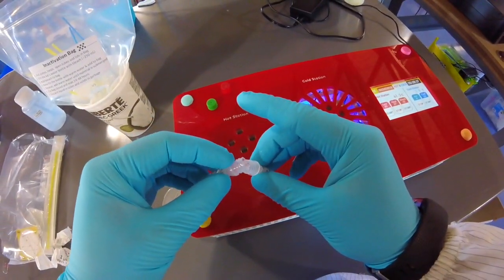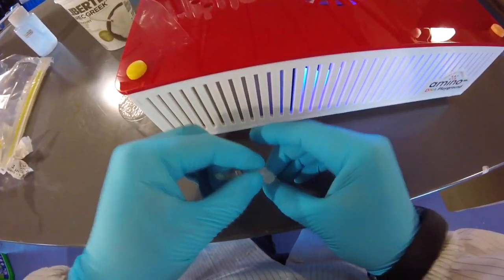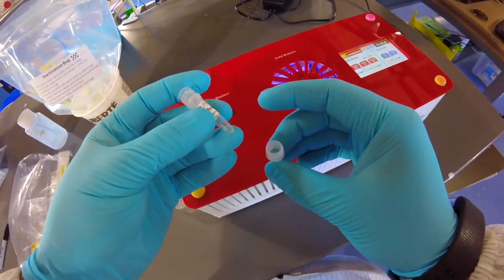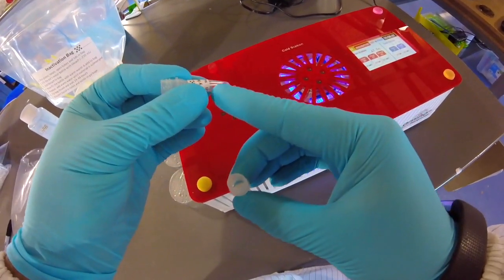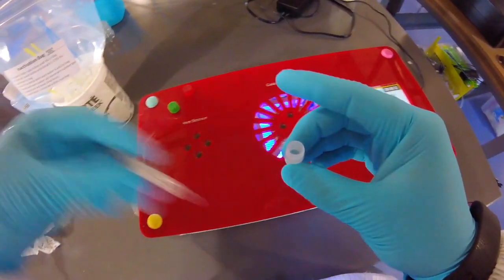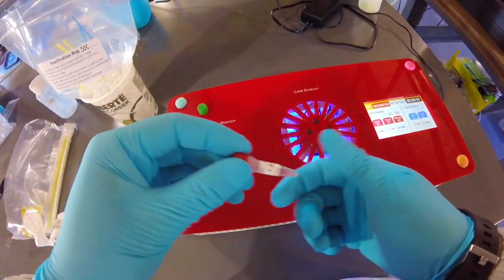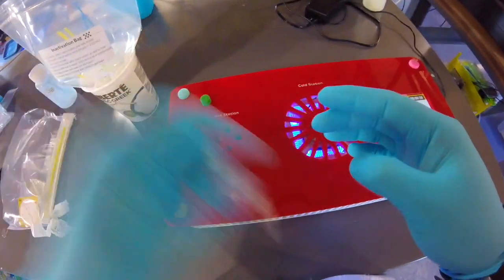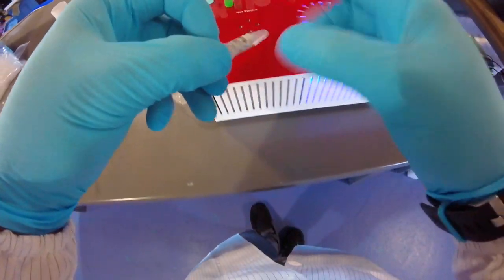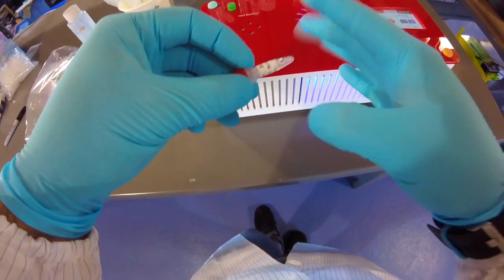And I'm just going to put it over top like this and on the table, not on the playground. I'm just going to give a little tap on the table and we're going to get pretty much all of it out. You've got plenty out if you see this little amount remaining. Okay, so you won't be able to get it all out, and we've accounted for that in the volume. I'm going to put the lid back on and you're just going to mix it. You can give it a little shake like so. There we go. Simple as that.